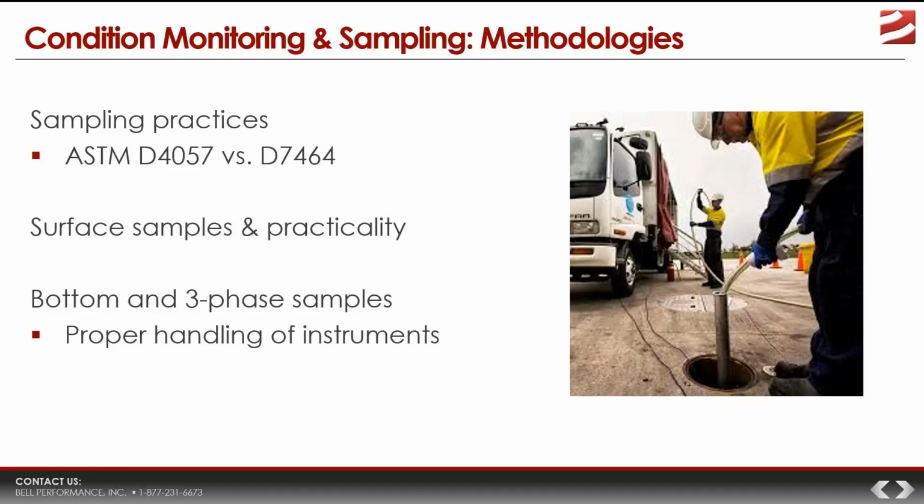So out in the field, practically, the best practice to prevent cross-contamination is you take the sample, you put it in an unused bottle, then you take your bacon bomb or your fuel sampler and you rinse it in alcohol before you collect the next sample. And that alcohol needs to be at least 70% alcohol by volume. And if you use other equipment like, let's say, a funnel to transfer the fluids, you need to make sure that's sterilized as well. So those are the kinds of things that go into good sampling.